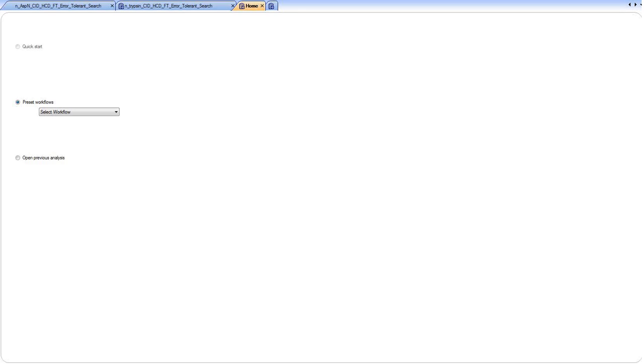This is a how-to video supporting Pinnacle software. The focus of this video is to explain error-tolerant searching for protein therapeutics. And again, the primary application for this workflow is to support a biopharma application. And the assumptions are that the protein that's under study is well purified or has very little background matrix effects.